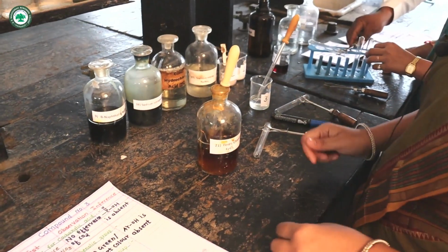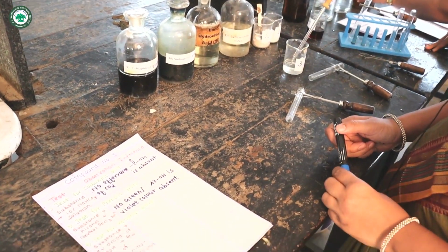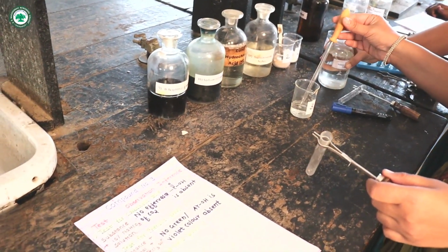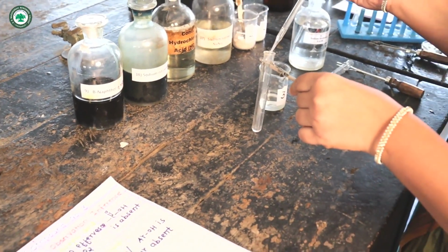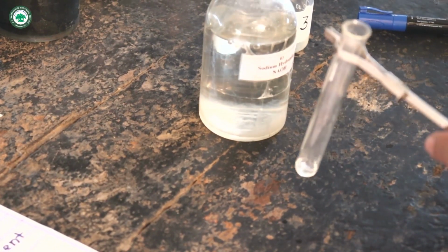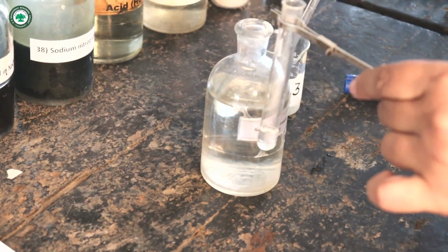Then third test for ketonic group, substance plus few drops of NaOH. Take a clean and dry test tube with test tube holder. Then add compound third, 1 to 2 ml. Add few drops of NaOH. Shake the test tube.